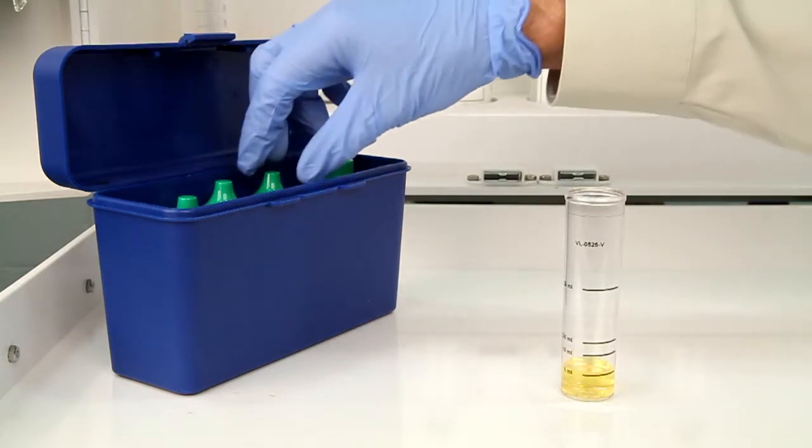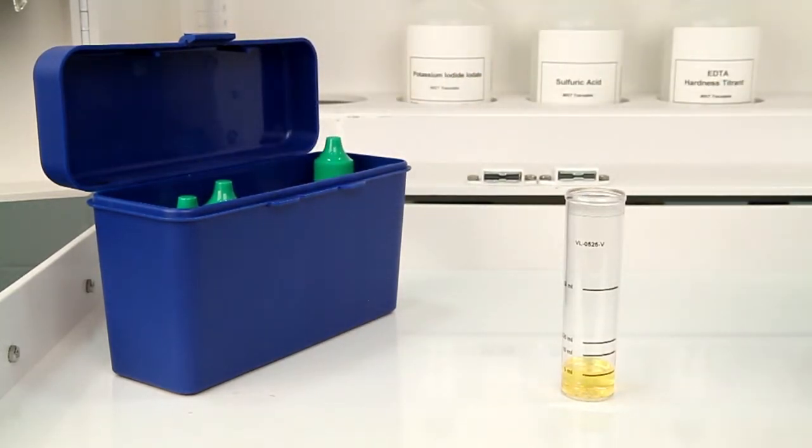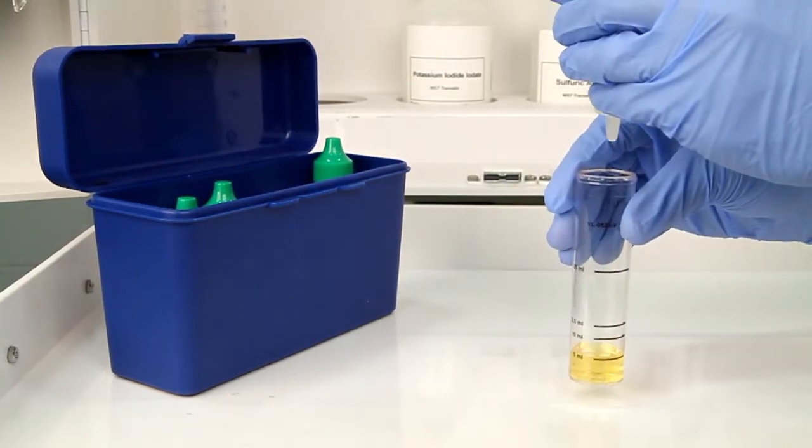The next step is to add 2 drops of starch indicator solution 0.5%. The bottle contains a dropper tip, so it's important to hold the bottle vertically to get a consistent drop size.